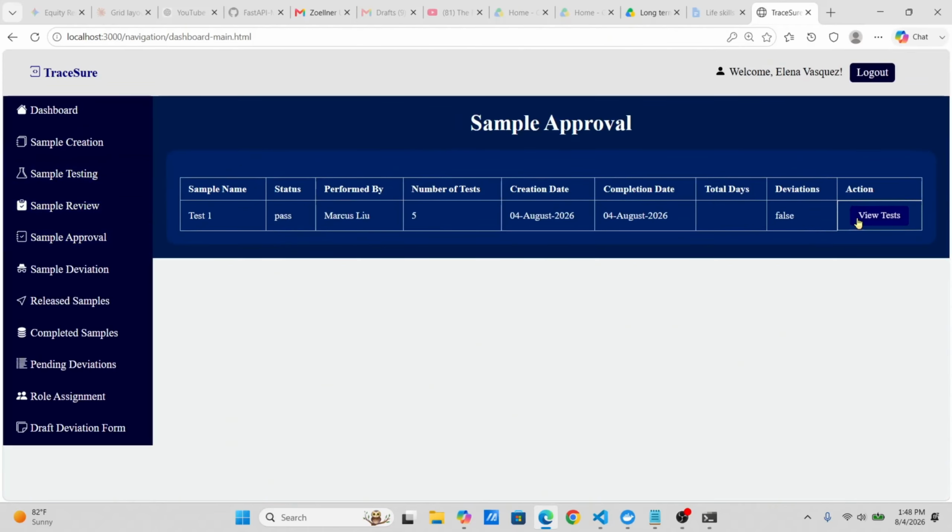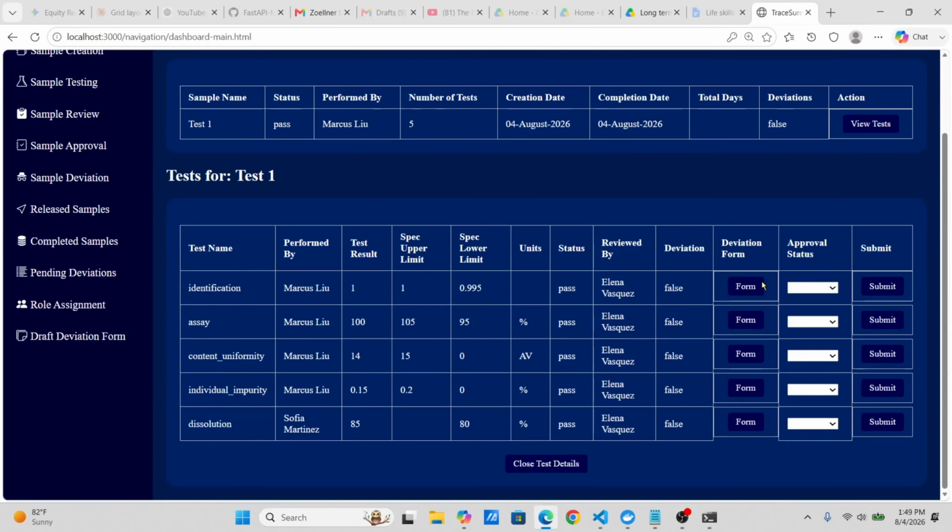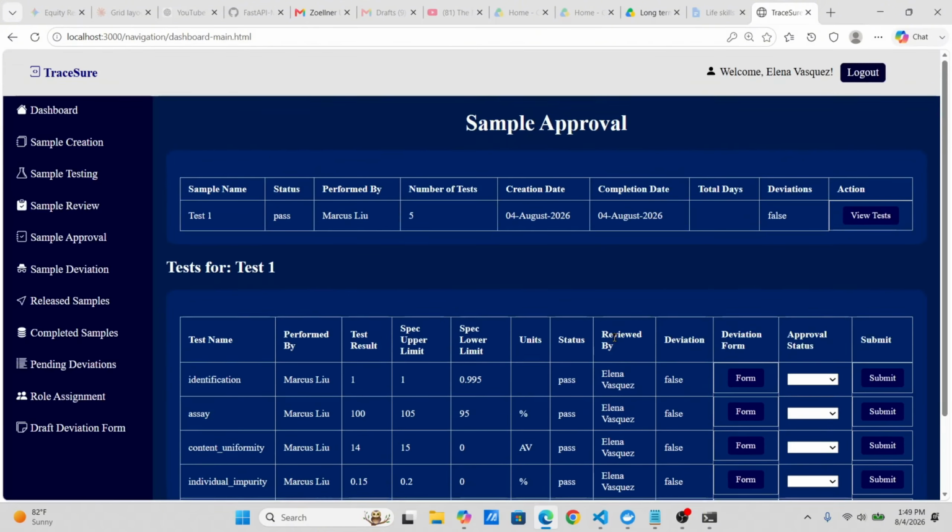I wonder what happened to the other testing. Oh, there it is. Oh, I guess I can review all of them. Oh yeah, she already reviewed it. I completely forgot that I already reviewed these in advance. I was confused. I was like, where did it go?